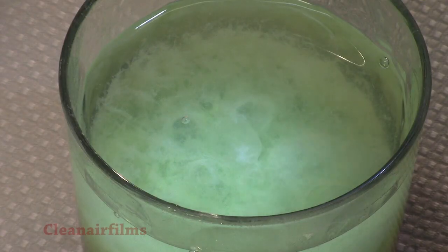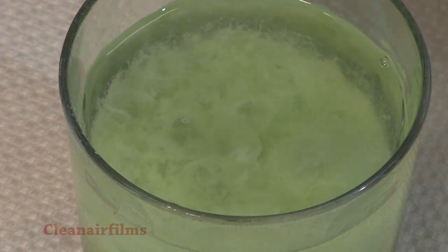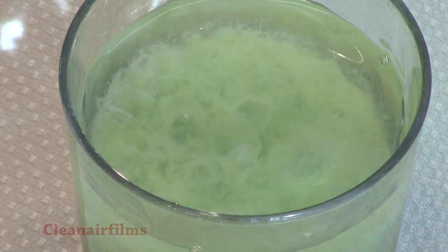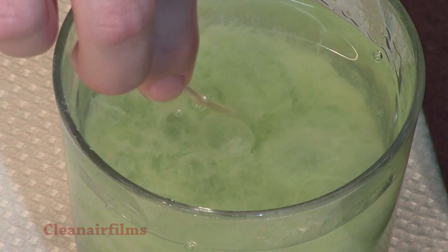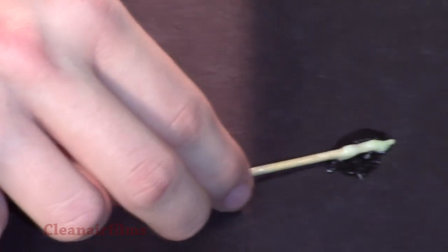Depending on how you did the experiment, you may be able to see large strands. The DNA in our experiment looks like a white mass. We can pull the DNA out using a toothpick. By putting it on some black paper, you can see the individual strands.